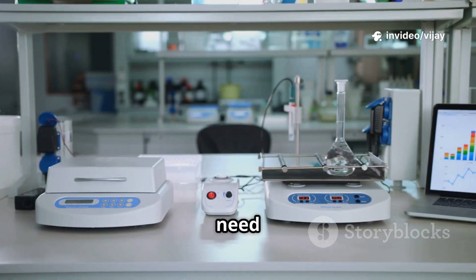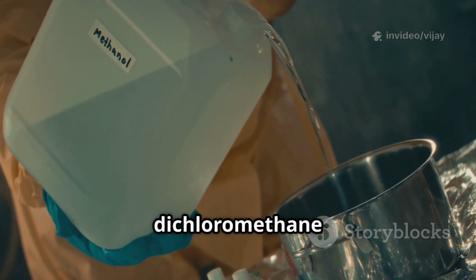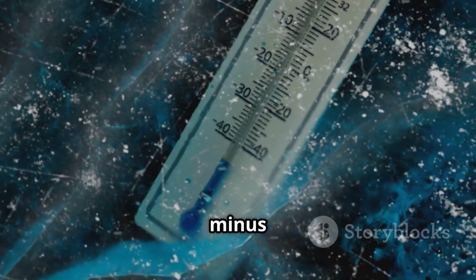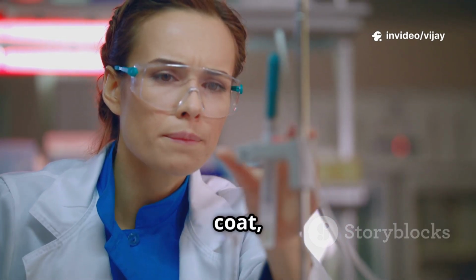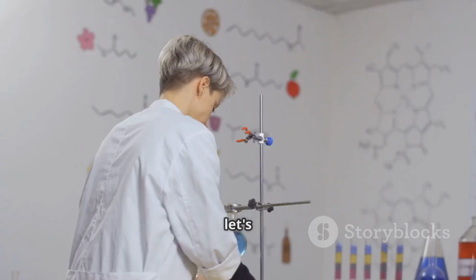Here's what you'll need: your chosen alkene or alkyne, an ozone generator, an inert solvent like dichloromethane or methanol, and a dry ice acetone bath to keep things nice and cold, usually around minus 78 degrees Celsius. And of course all your proper PPE: gloves, goggles, and a solid laboratory coat, because ozone is not something you want on your skin. Right, let's do this.